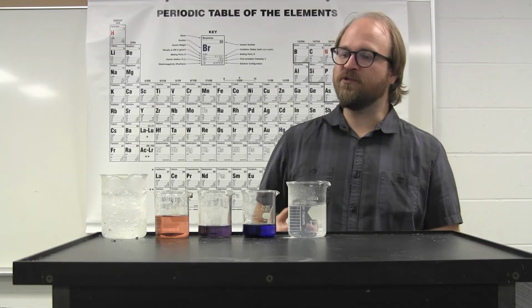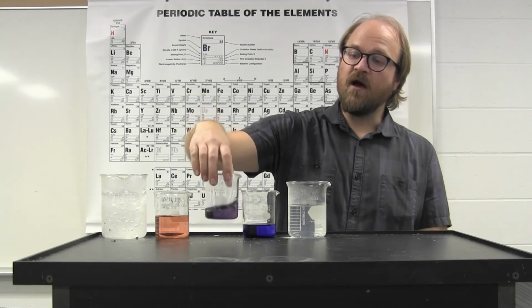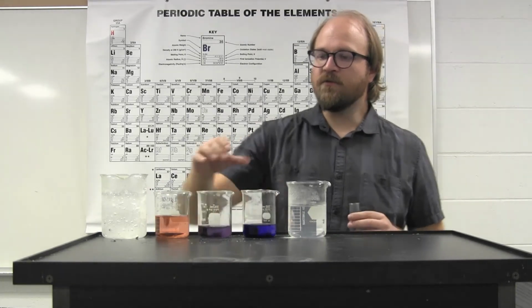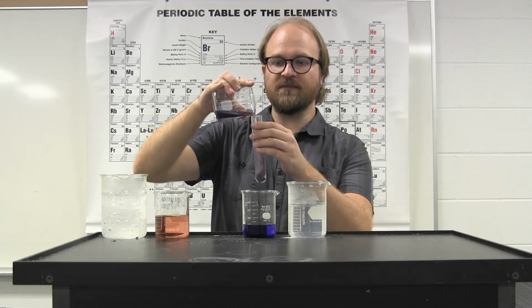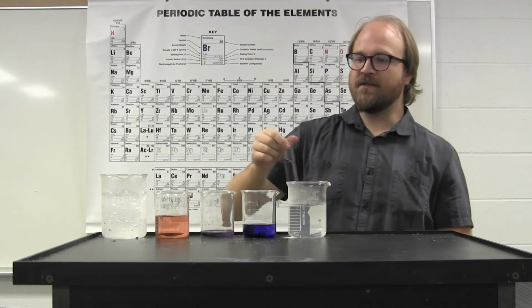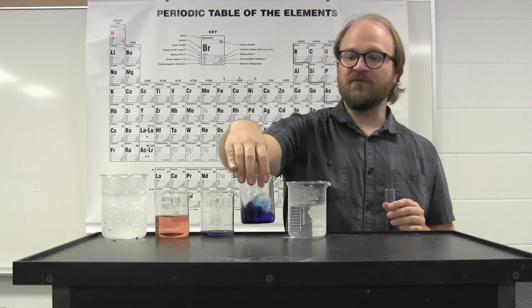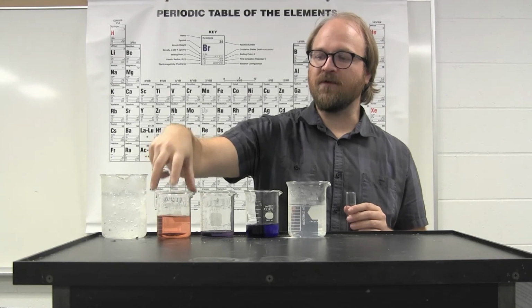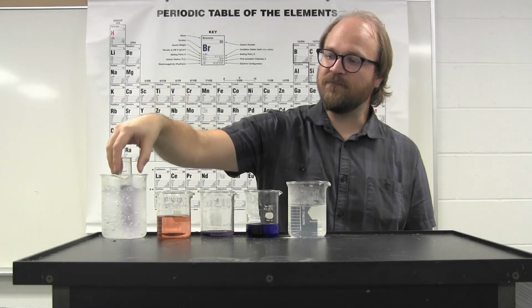With the cobalt solution prepared and properly mixed to achieve a blend of both complexes in equilibrium, you can move on to the last part of the experiment, which is the temperature dependence of the reaction. The blend is a purple color, a mixture of the blue tetrachloride complex and the red hexaaquo complex. The reaction itself is temperature dependent.